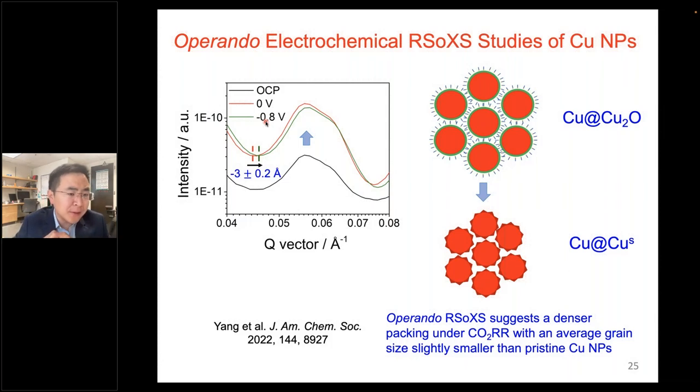boundaries in between particles. So now, if you recall what we were tracking using 4D-STEM, this provides a mirror image of that, but more from the spectroscopy and scattering pattern, to show the dynamic aggregation process of particles.